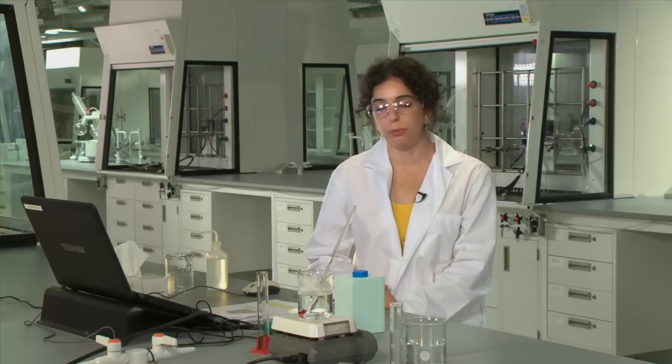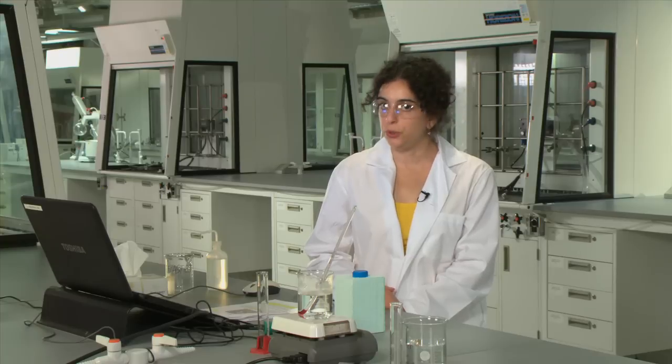In this experiment, you will be ultimately determining the heat of solution for two salts.